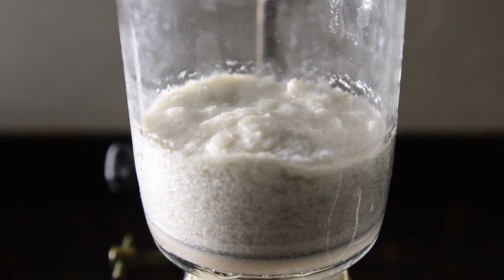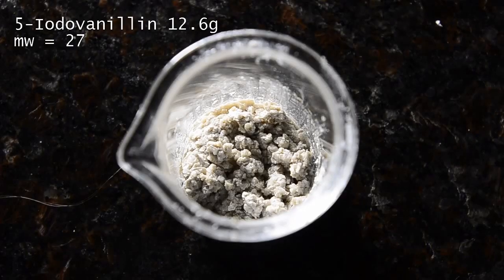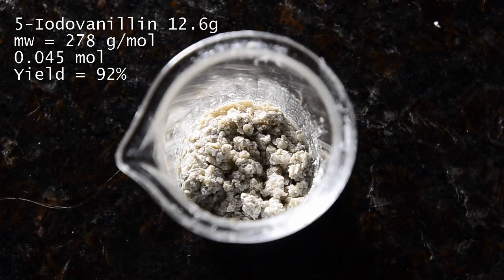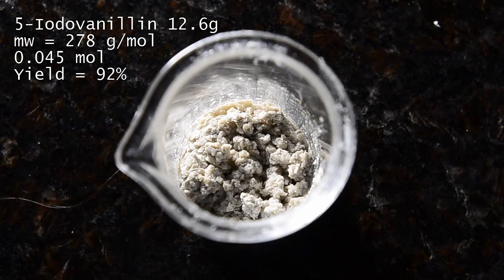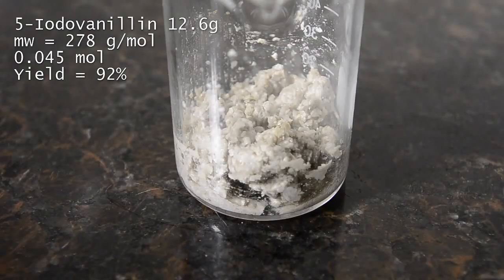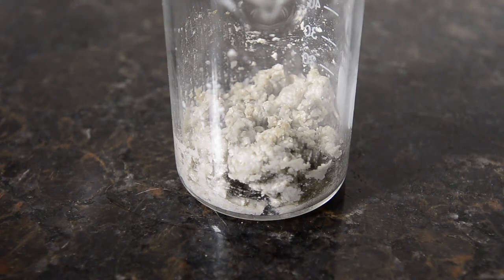Our finished product was a pale tan, almost gold-colored solid with an almost quantitative yield from the starting vanillin. The product only has a very faint vanillin aroma. This is a useful intermediate compound which can be used to make 5-hydroxyvanillin and also syringaldehyde. Stay tuned.